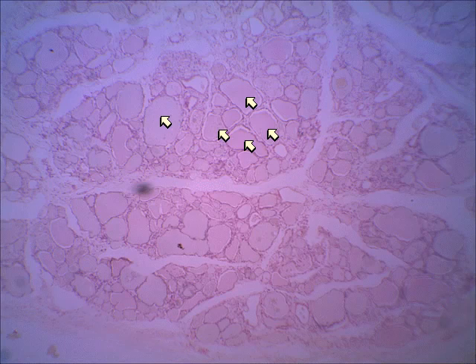You remember from A&P 1, those look like just big empty cells because the triglycerides are dissolved out. Well, here, these are big follicles that are filled with a colloid substance where the thyroid hormones can be temporarily stored. The cells that are around the follicles produce some of the hormones, and then cells in between the follicles produce other hormones of the thyroid gland.